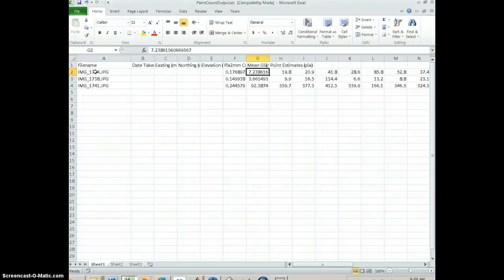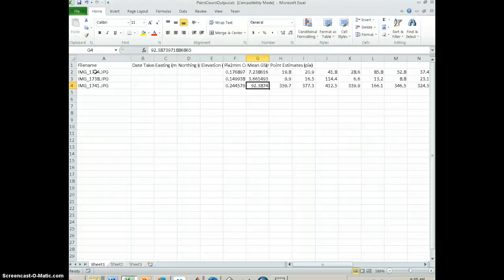And then it's going to give me the average grain size in millimeters. So you can see here that first photo, which was sort of smallish gravel, gives me an average grain size of seven millimeters. Almost a centimeter, that seems about right. And then this one, the next one was sand and some small gravel. So you have a smaller average grain size. And then here, this one, 92 millimeters, that's almost 10 centimeters or a few inches. And that was that large cobble photo.